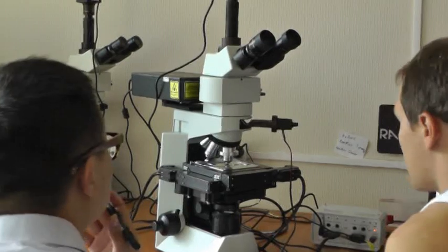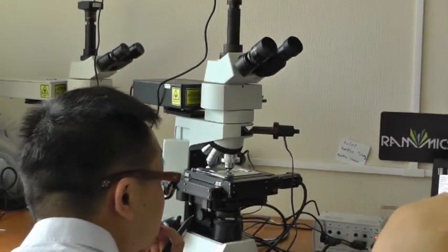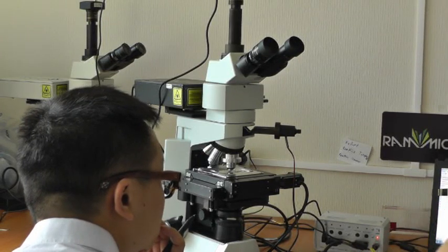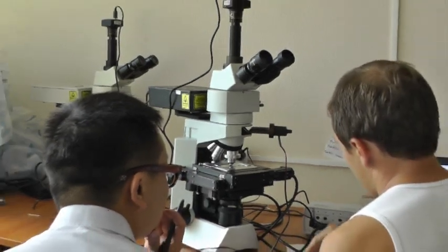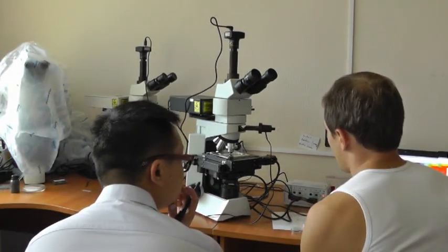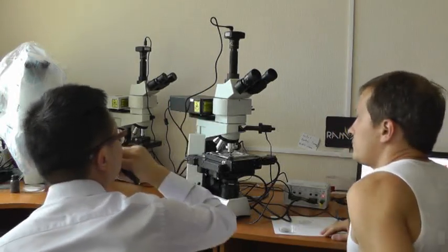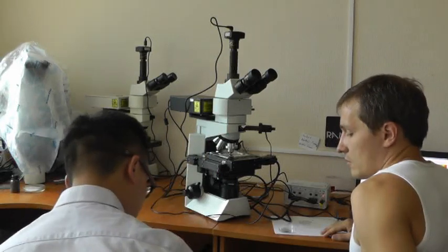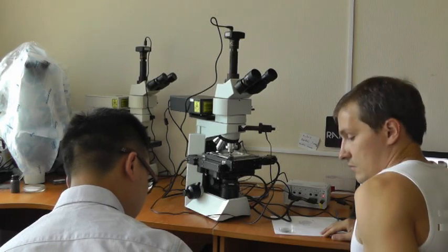Okay. In my understanding, it has to be an infinity optic system. I mean, the light here should not be like this.